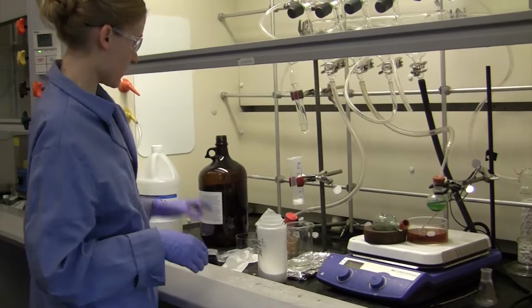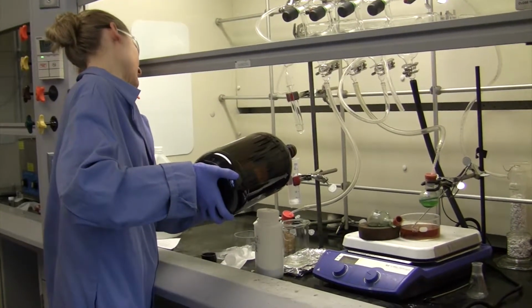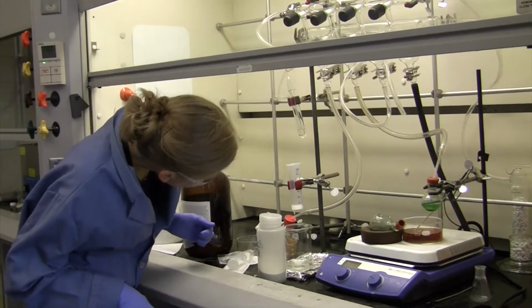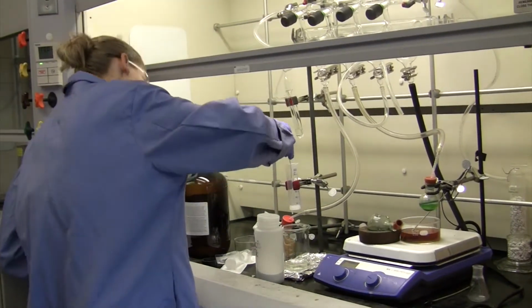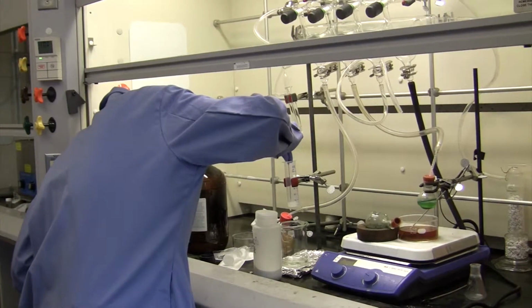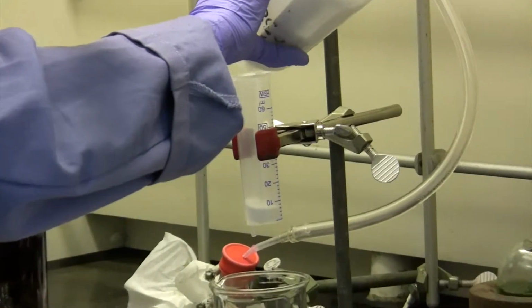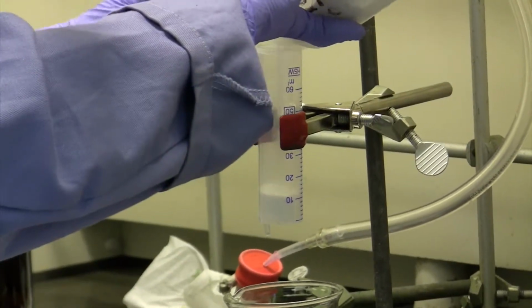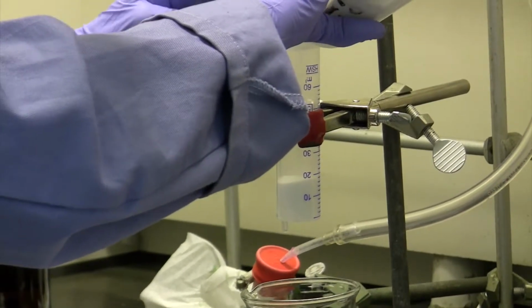I'm nervous now since my cotton ball moved, so I'm just going to add a little bit more wet. The wet cotton ball is much less likely to move. Slowly add the silica, tapping a little bit. Like I said, we need about an inch of silica to get out all of the copper.